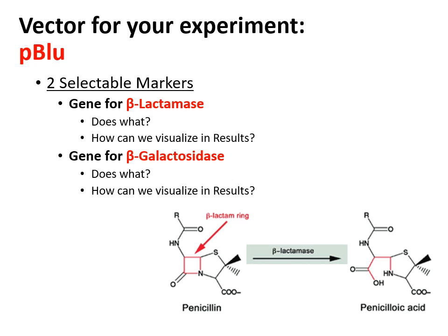And so if you then cut that beta-lactam ring open so that it's now an open chemical structure, that antibiotic can no longer bind to the bacteria's enzymes and it can no longer kill that bacteria. So you have now, with this gene, made that bacteria antibiotic resistant.